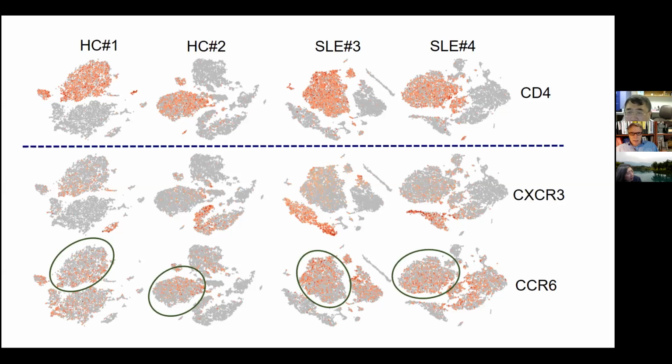CCR6 and then another marker. I was just wondering, Mingao, now that you show it like this, she could do it. Yeah, of course we can zoom in. Gate on CCR6 positive and the other, because two chemokine receptor genes define Th1 and Th17. Yeah, that's right.